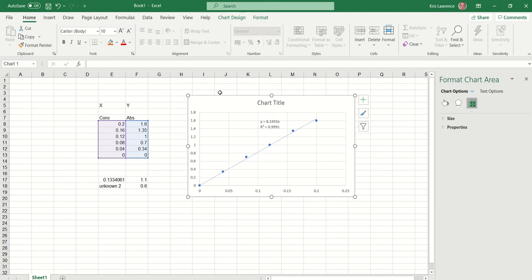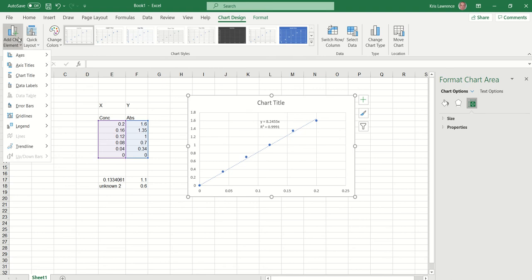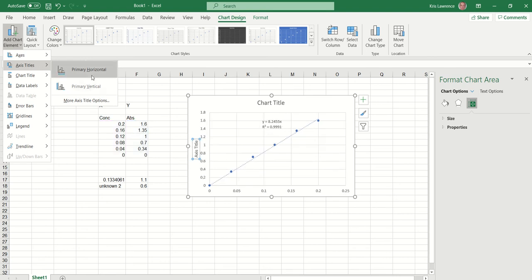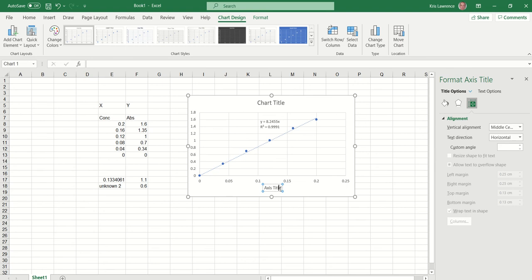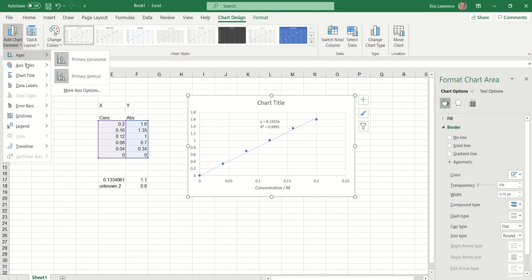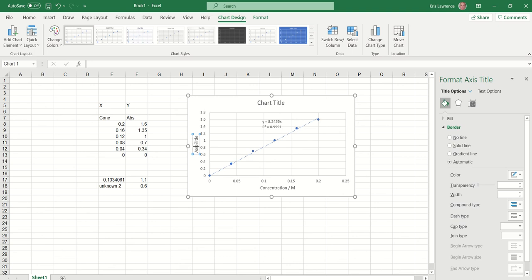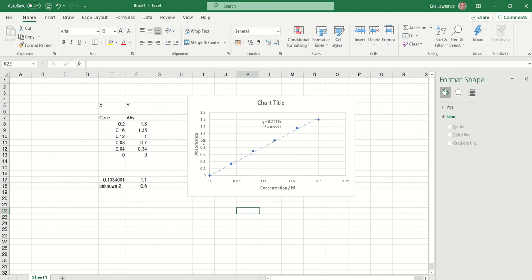When you click on the graph, you can click on Chart Design, then Add a Chart Element on the top left-hand side. We've got axis titles we can put in. On the horizontal, I'll put in concentration with its unit. And if I repeat that on the vertical — absorbance doesn't have a unit, but at least now we know what these values actually mean.